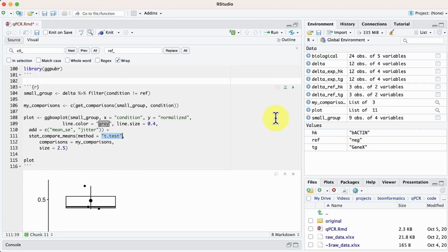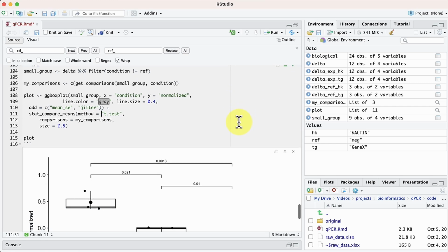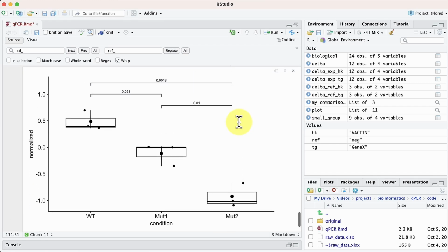For years I have been using Excel to crunch the data, but the method is error-prone, difficult to debug, and difficult to scale. In this video I will show you the script that I use to, in one click, generate publication quality figures, including the statistical analysis.